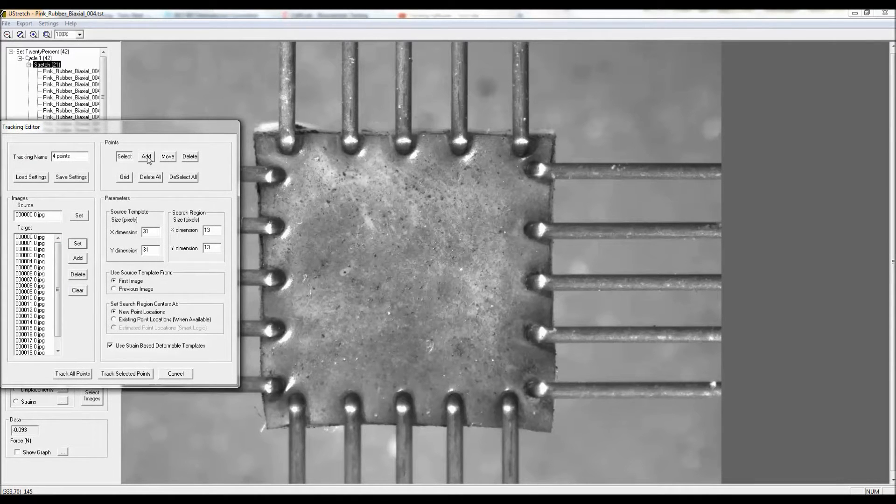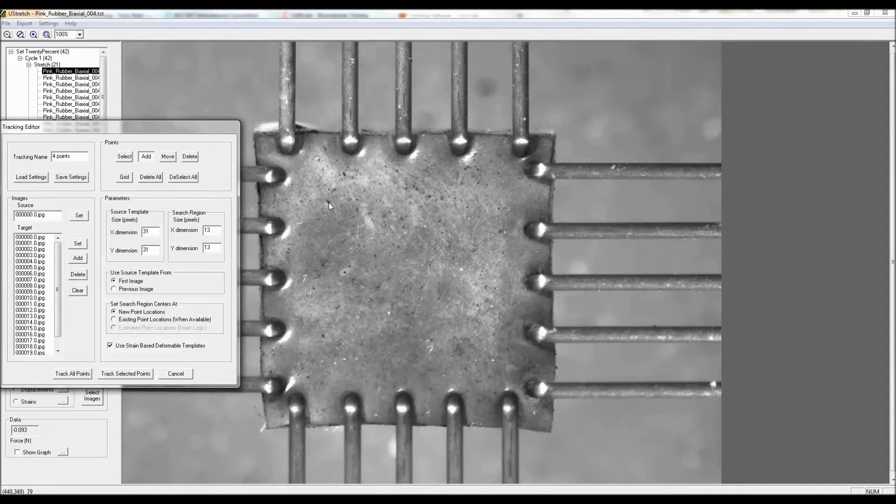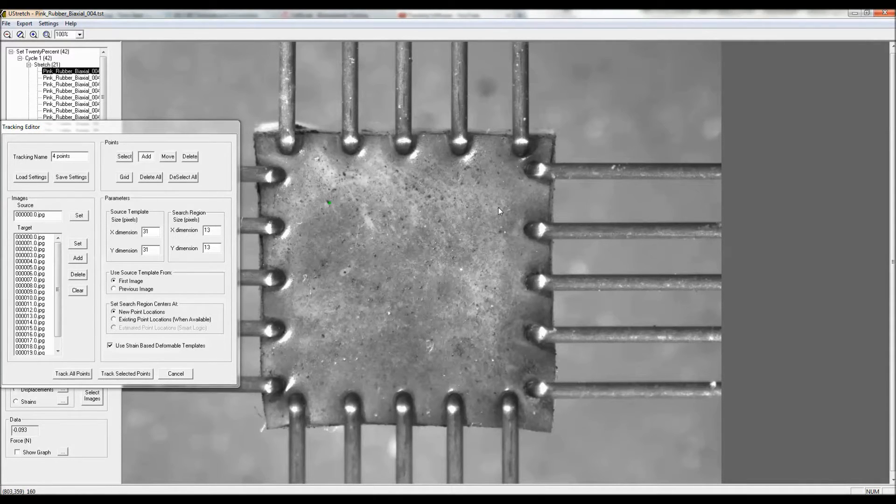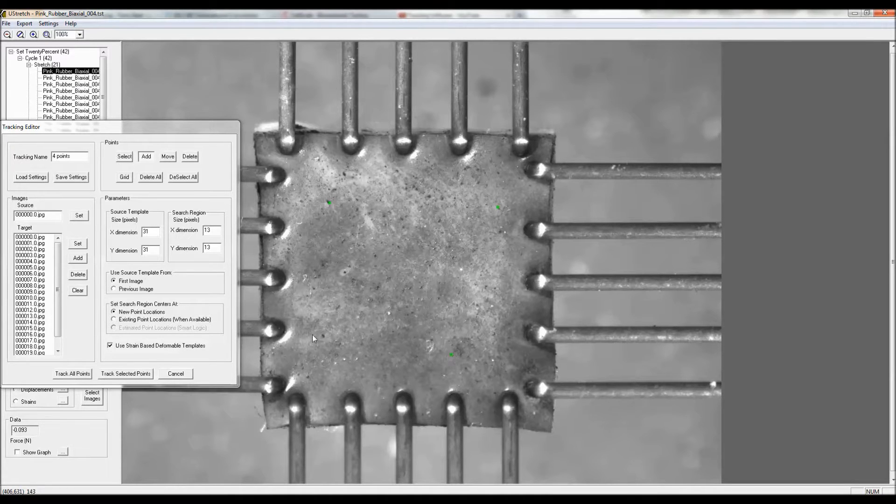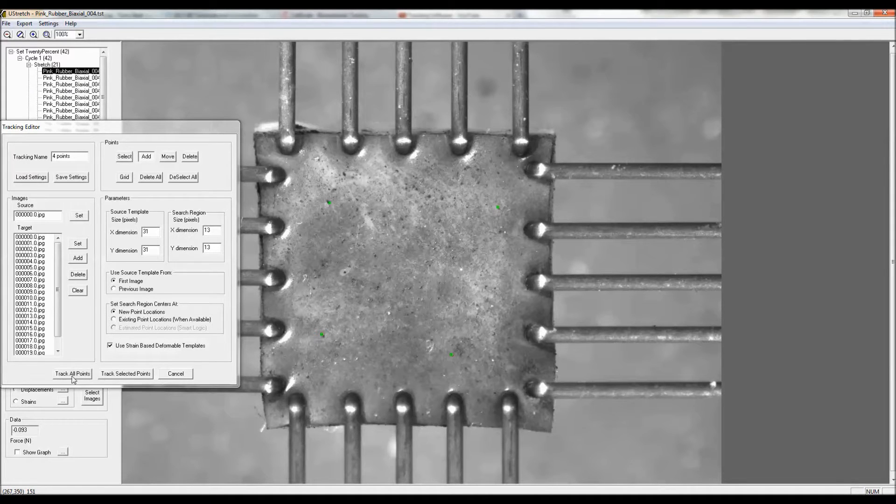I'll click on the add feature to add points to my initial image, and I'll select some features, for example this black dot here and a few others on the surface of the specimen, and I'm going to use the default parameters to follow those points through this 20% strain.